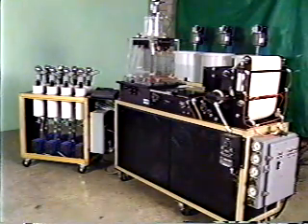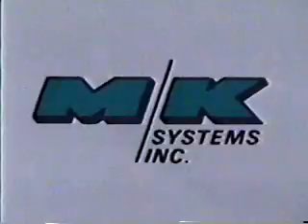The sheet former is not limited to paper. Virtually any material that can be made into a sheet can be used.